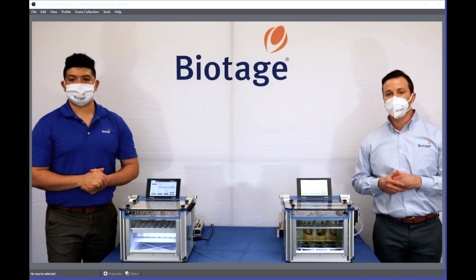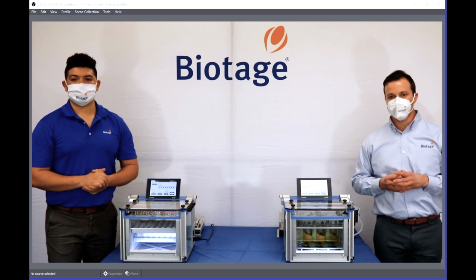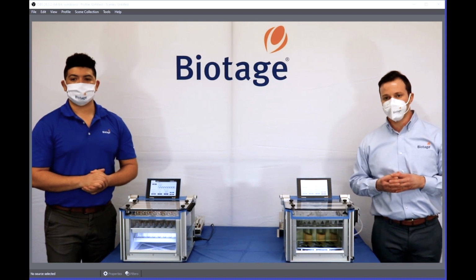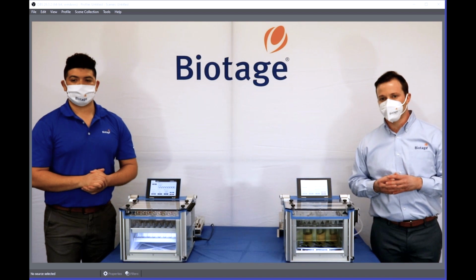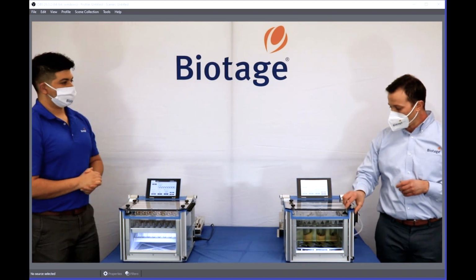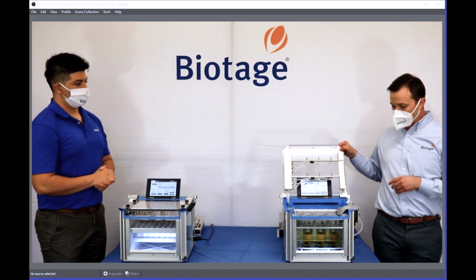Another one is asking, if you lift the lid, does it pause? And then on top of that, when you start it and pull it back, will it start where the level was of the nitrogen? Yes, actually, when you lift the lid, it will pause.